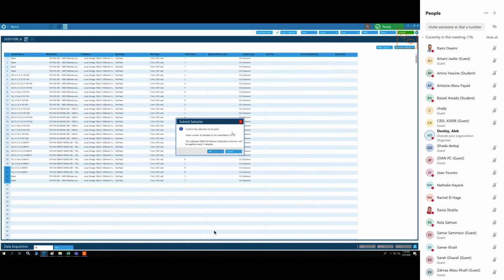So you can submit from the batch multiple times, again and again. You can submit 1 sample 30 times, or you can submit 30 samples once. It's really up to you. And again, you have no fear of overwriting. It will just add to that data file. So if you do end up with multiple samples in the same data file, that's not something to be afraid of.